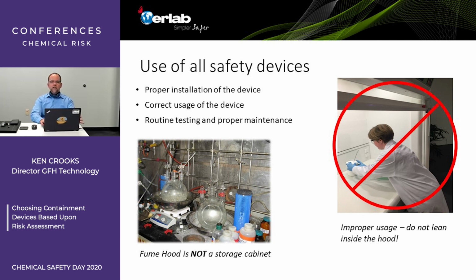It is not a storage cabinet. The lower left picture here is just a completely misused hood. That is a fire waiting to happen. That's just not good at all. A lot of hazards shown there. Store the chemicals in the appropriate storage containers after their use. Do not leave them in the fume hood unless you're going to immediately use them.